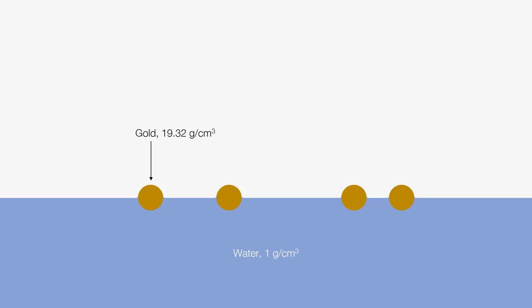The exceptionally high surface tension of water allows us to trap materials that are many times more dense than the water itself. The area in which these particles are trapped can be reduced or expanded with barriers that move across the water's surface.